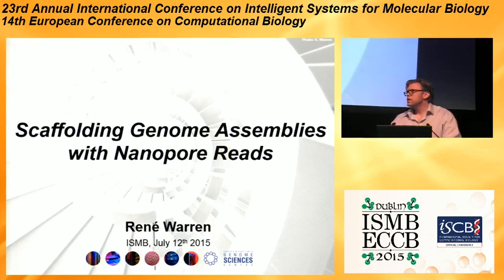So I've been interested in the assembly problem for about a decade. Previously I worked on short read assembly, and I'm currently working with the ABySS team on Nanopore. This talk is not about a de novo genome assembler. It's about a scaffolder. It's not about error correction of nanopore reads. Instead, we have used this emerging long read technology to rescaffold draft genomes, high-quality draft genomes.